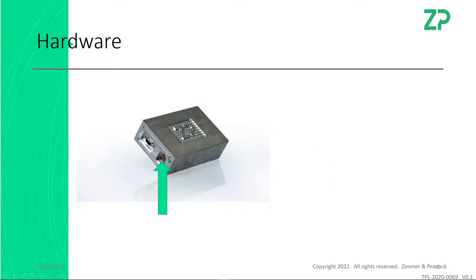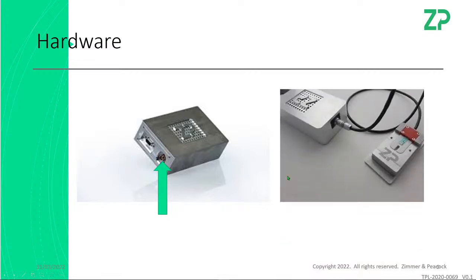Now the Anapot EIS has a LEMO connector here, a 5-pin LEMO connector. I mention it because I would run it, as I've shown here, when you plug in an adapter, and the adapter comes to a screen printed electrode, and I'll touch upon that next.